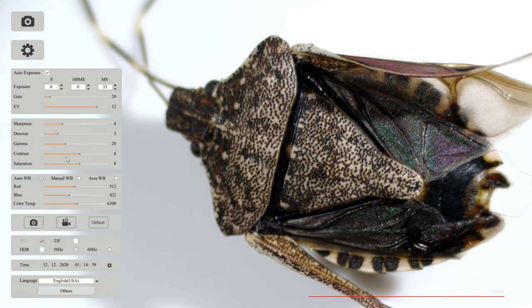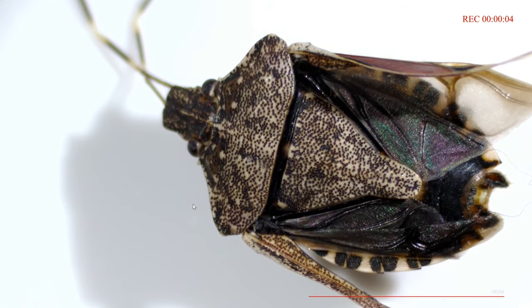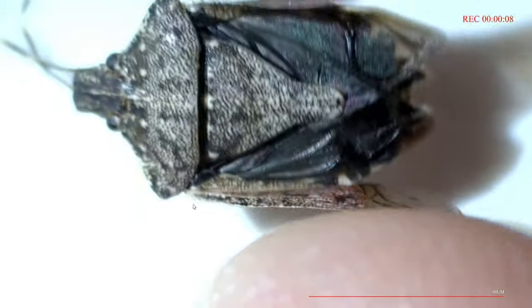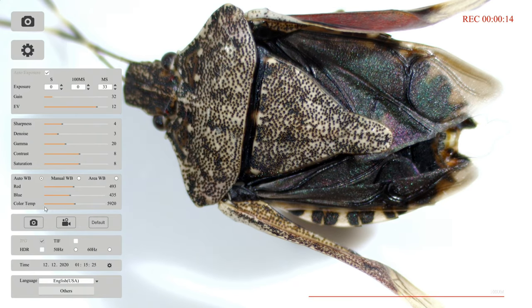Below that we have automatic white balance, which works perfectly in just about every single situation. But manual white balance is there if you'd like to tweak your images. With the video camera icon, I can easily capture a 4K video — you can see I'm moving around my stink bug. And as soon as I'm finished with my video, I can click on that video camera icon again and it will save the video to the jump drive.